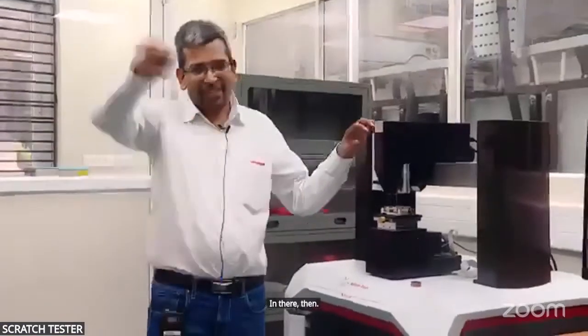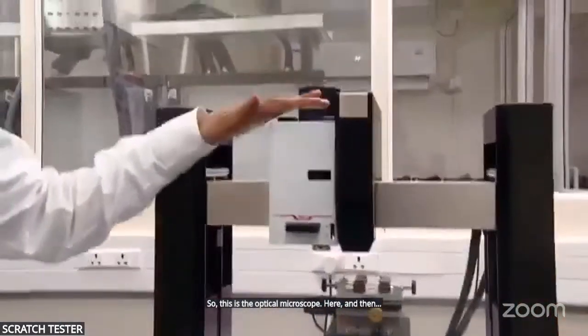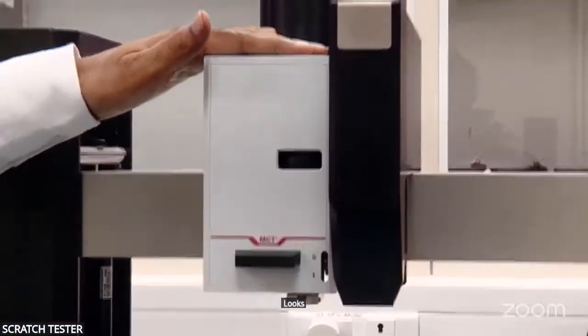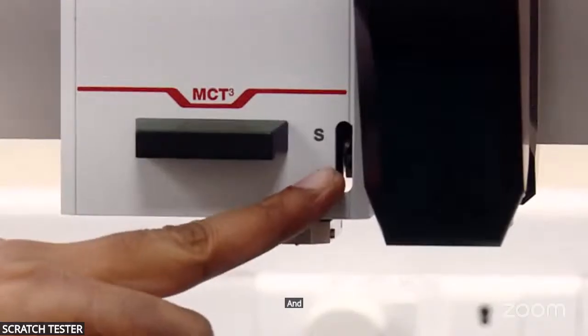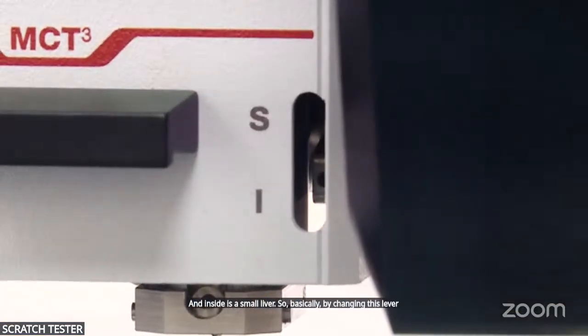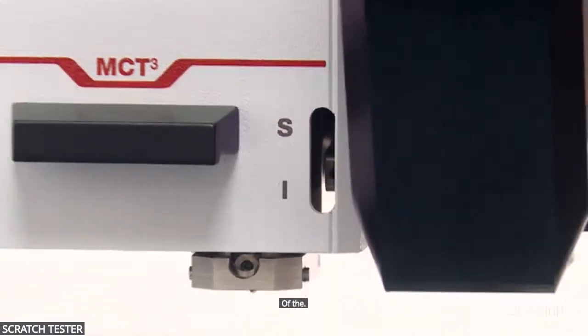Then, this is the optical microscope here, and here is what our MCT head looks like. If you can see, we have an option I and S, and inside is a small lever. By changing this lever, we move the position of the system from scratch to indentation.